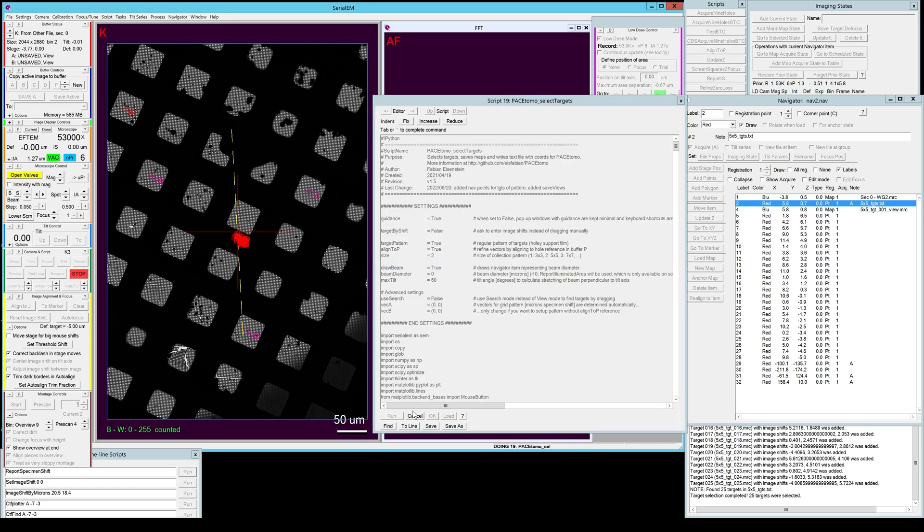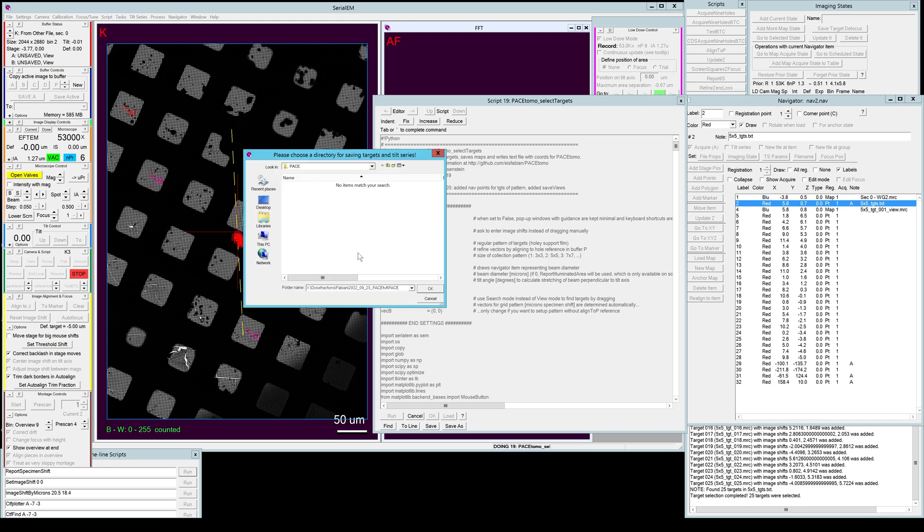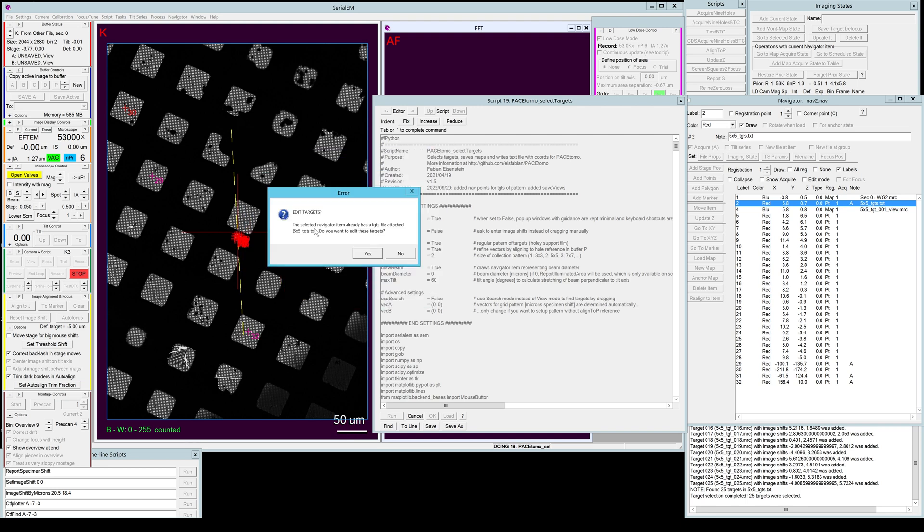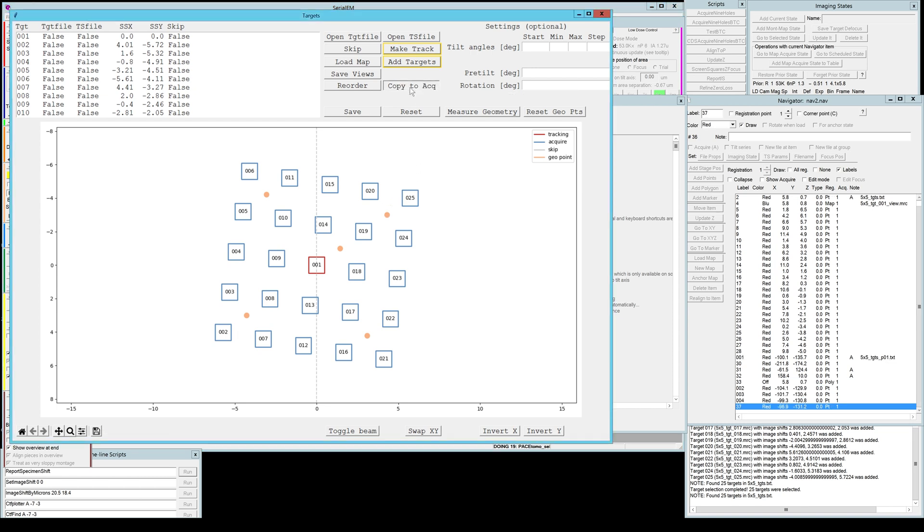Then we're going to go back to our original pattern text file here and we're going to run the select target script again. It will ask you the same questions, it will ask you to select a folder again, and then if it finds the target file in that folder it will ask you if you want to edit the targets. In this case we do want to edit these targets. It reloaded the geometry measure points too in case you are worried about losing them before. Now we can run the copy acquire script.